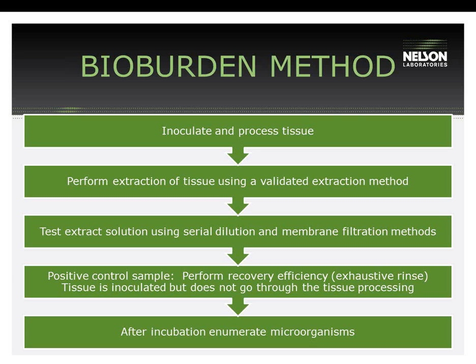Once the dwell time is completed, the positive control is extracted through an exhaustive extraction, usually 4 extractions on the same sample, and plated on appropriate agar through spread plate dilutions and membrane filtration methods. Once plated, they are incubated and enumerated. The rest of the samples are processed with a chemical or the antibiotic treatment and then extracted and plated, same as the positive control sample.